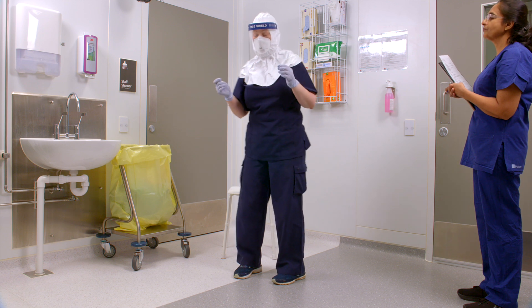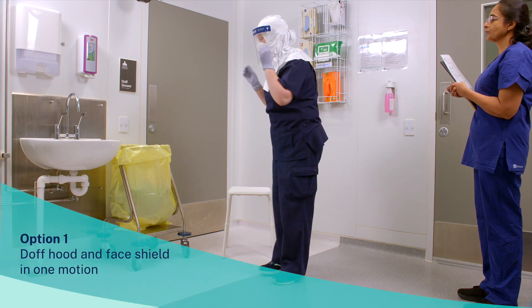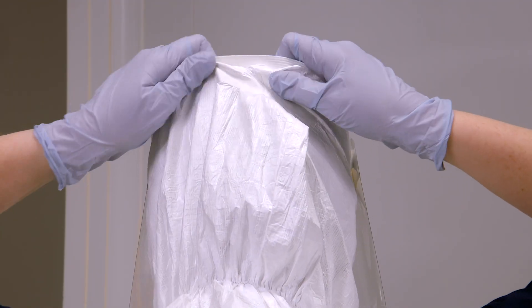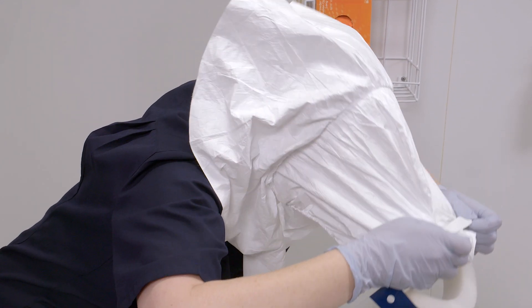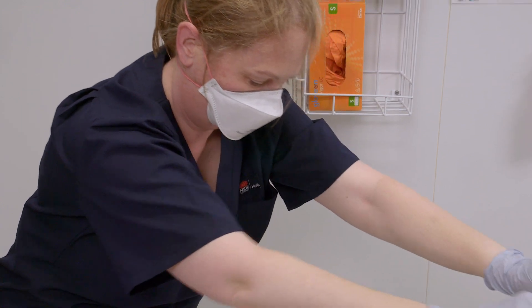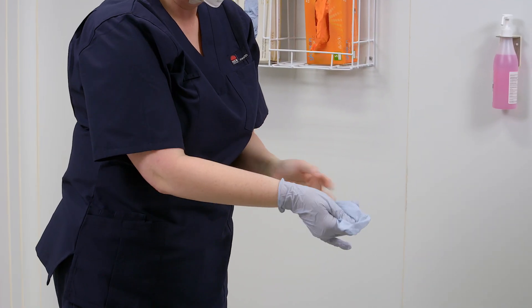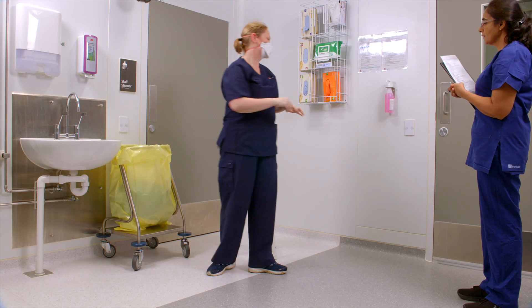This video will provide two examples of safely doffing the surgical hood and face shield. Option 1: doff the hood and face shield in one motion. Grasp the back of the hood and elastic straps of the face shield. Bend at the waist, tilt head downwards, and pull forward in a downward motion removing hood and face shield together. Place in clinical waste bin. Check gloves for contamination and remove gloves. Now perform hand hygiene.